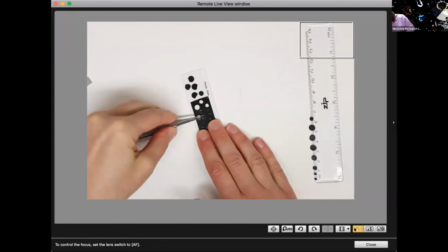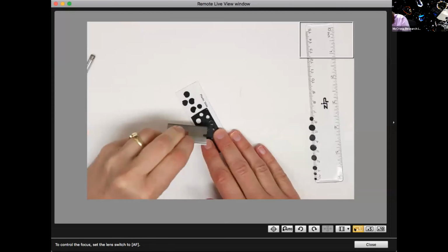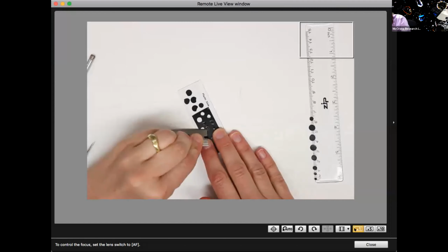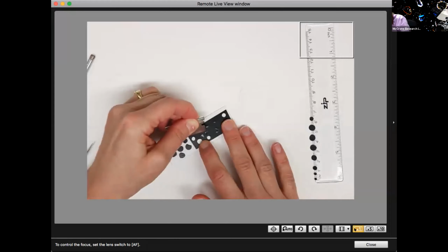And you can see as I try and tease this one off, I have ones that I made with hole punches, and those actually didn't turn out very well because they kept cutting off a portion of it and leaving a chunk missing. So you definitely want to make sure you end up with a good round spot. So let's see if we can get this one working.